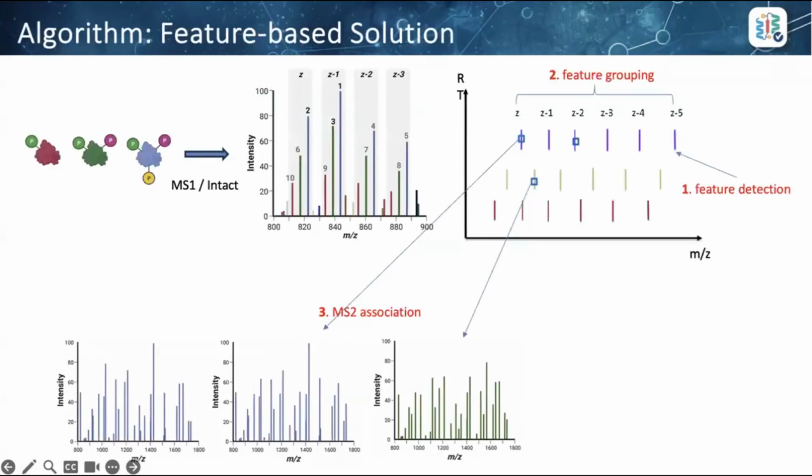Before diving into the detailed functions or features, I would like to briefly introduce the core algorithms behind ProteoformX. Across all workflows, intact mass, top-down, and bottom-up based, and for both identification and quantification, ProteoformX is built on a feature-based approach.